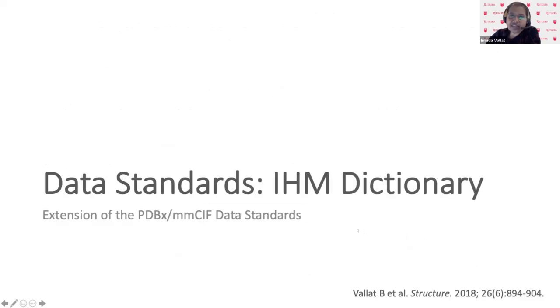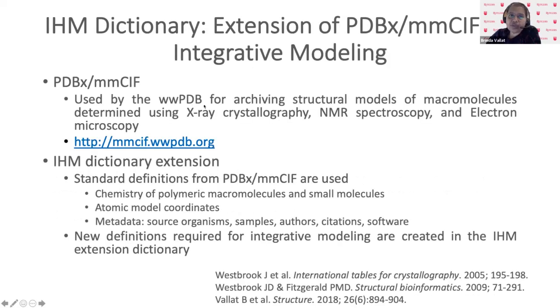Let's first look at the first requirement, which is the creation of data standards. We have created the IHM Data Dictionary, which is an extension of the PDBx/mmCIF Data Dictionary. PDBx/mmCIF is used by the PDB and provides the data standards for archiving atomic structures of macromolecules determined using X-ray, NMR, and 3D EM.